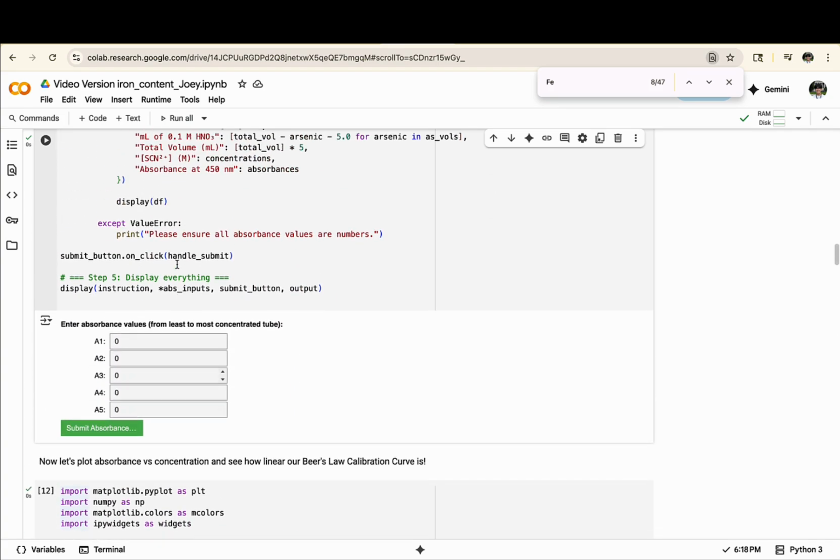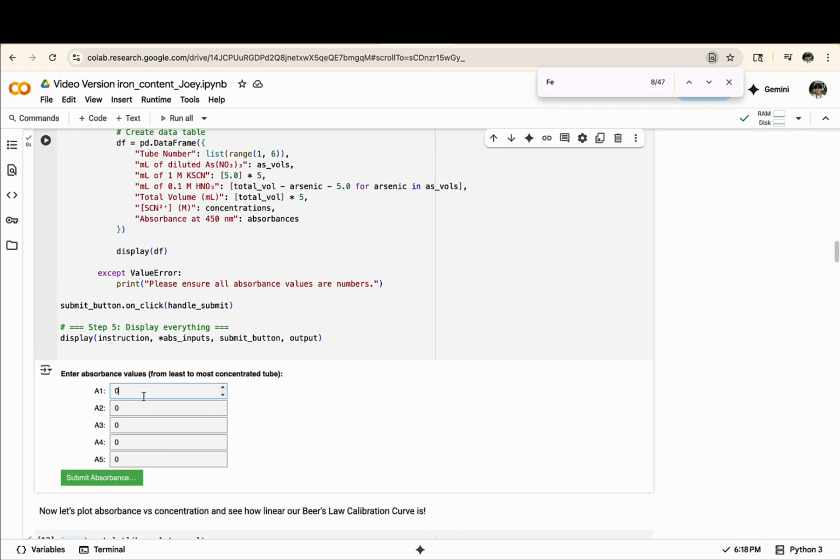its own molar absorptivity, which is also referred to as extinction coefficient or just epsilon value. This value reflects the strength of the absorbance at whatever lambda max is, and our goal is to find that value.